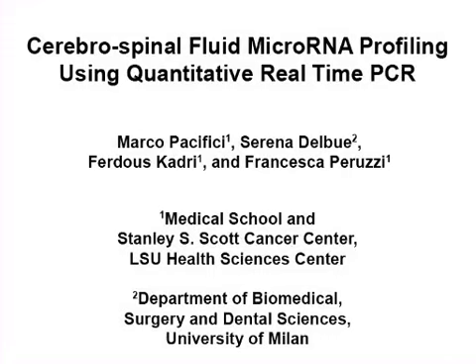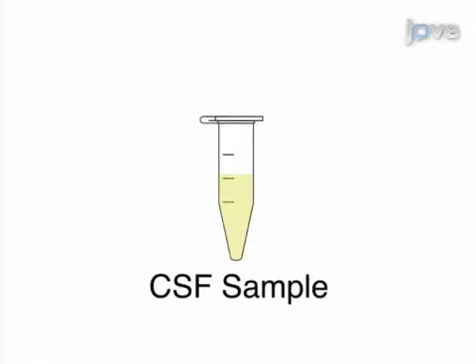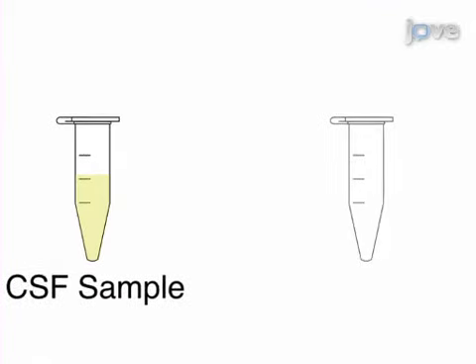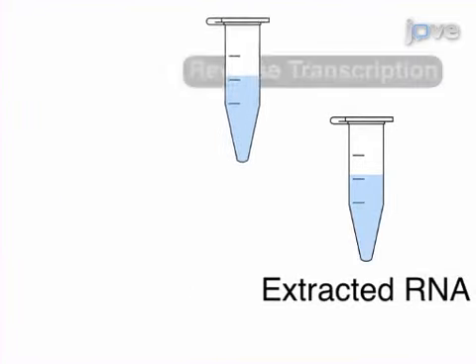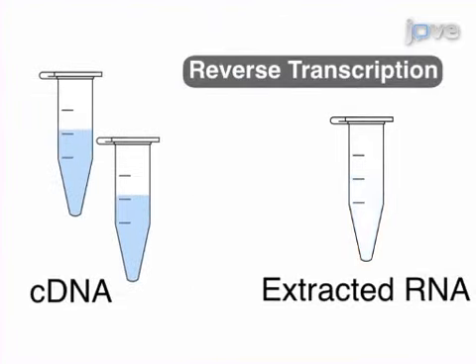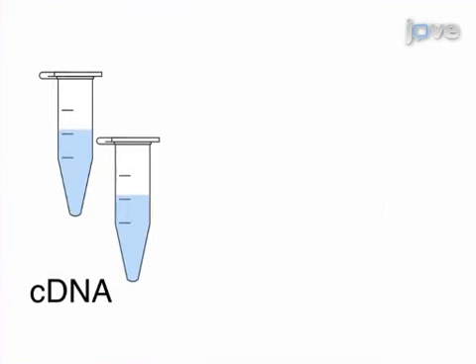The overall goal of this procedure is to profile microRNAs in cerebrospinal fluids by quantitative PCR and to analyze the data using GenEx Professional software. This is accomplished by first isolating total RNA from cerebrospinal fluid samples. The second step is to perform reverse transcription in order to transcribe the RNAs into cDNAs.